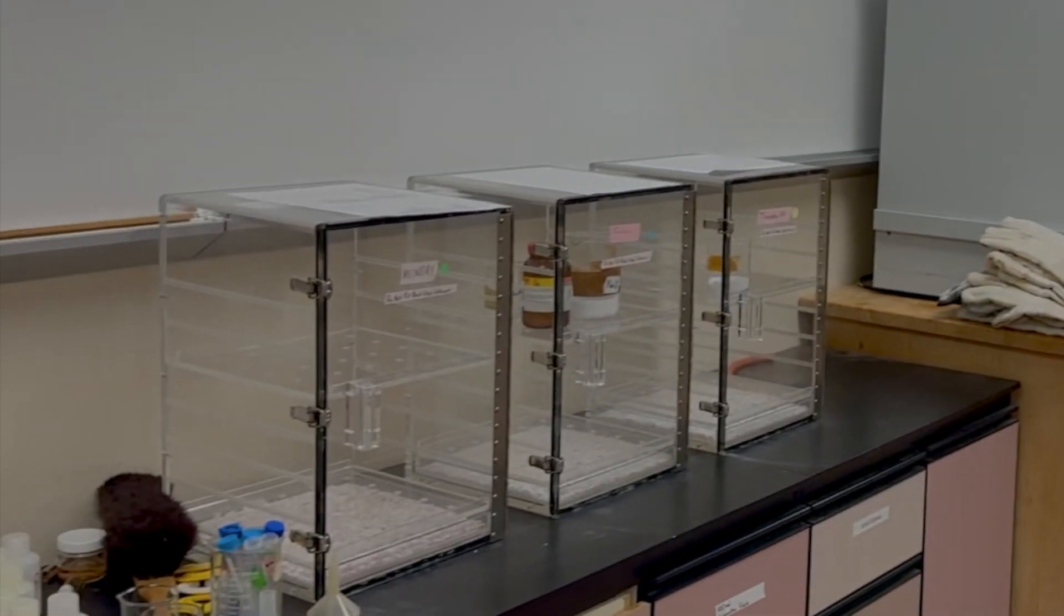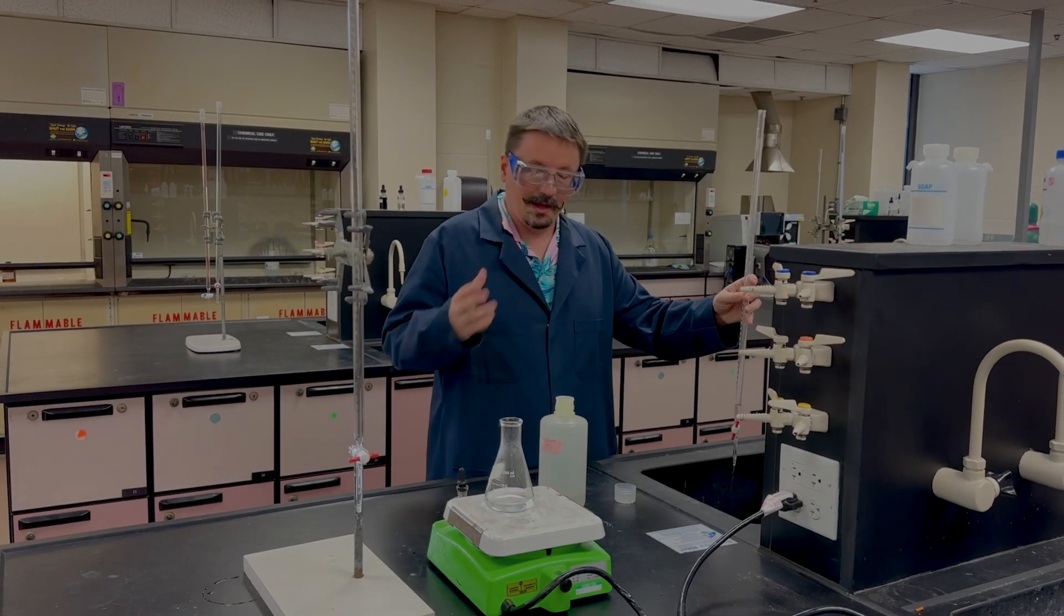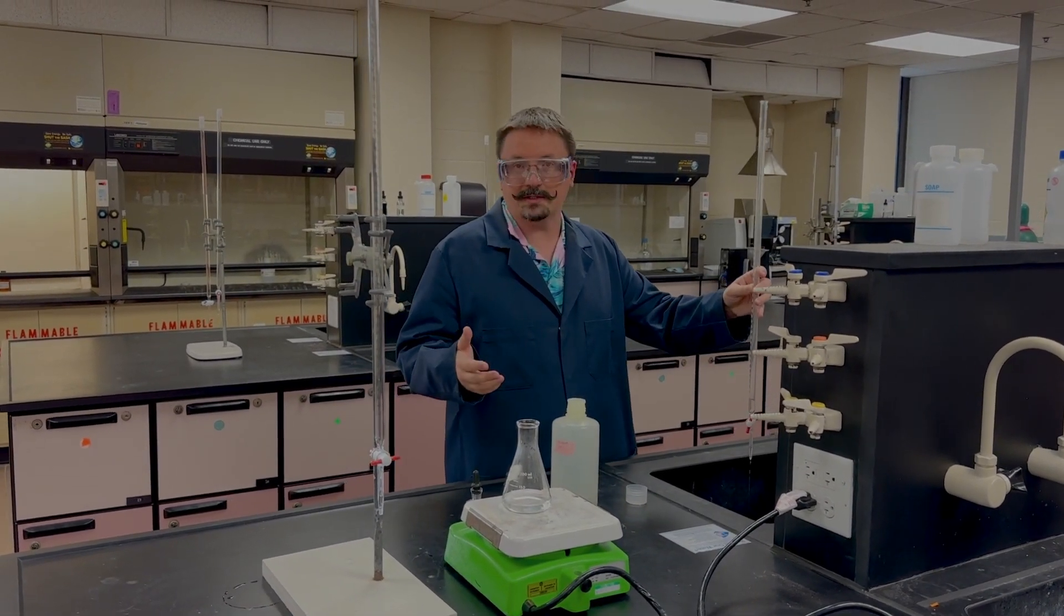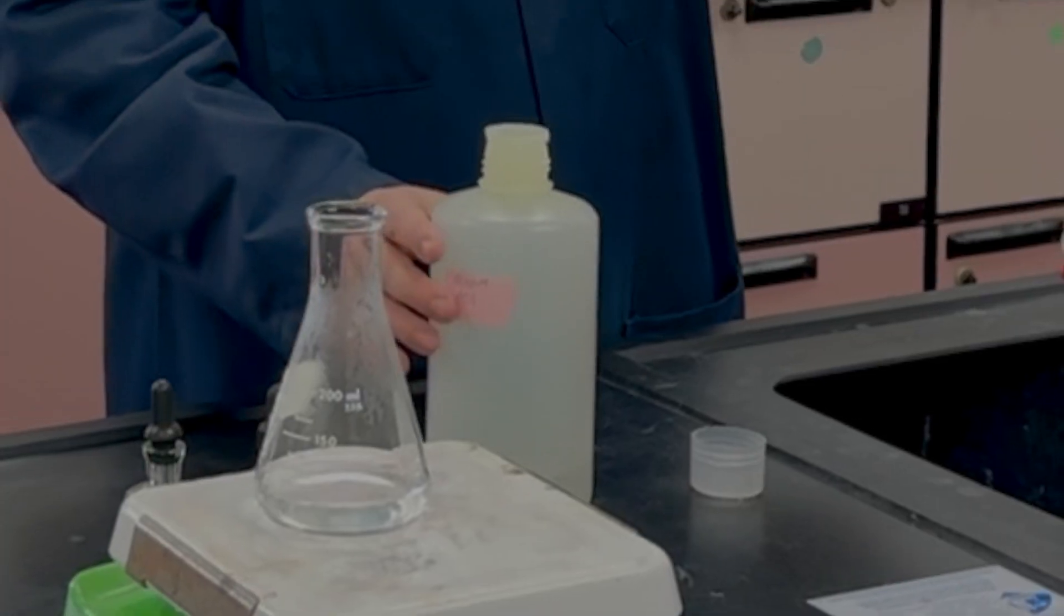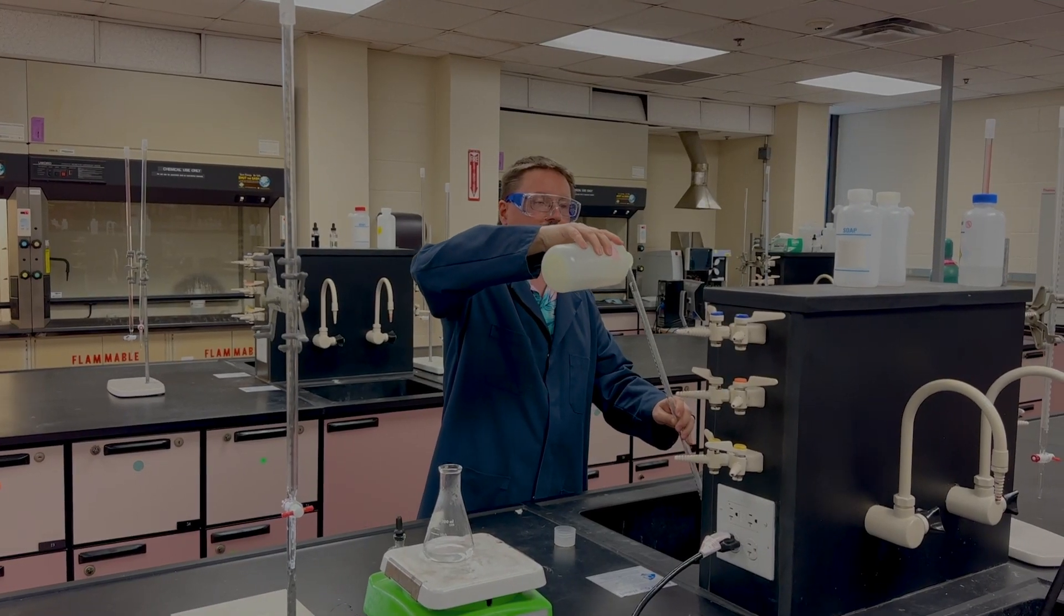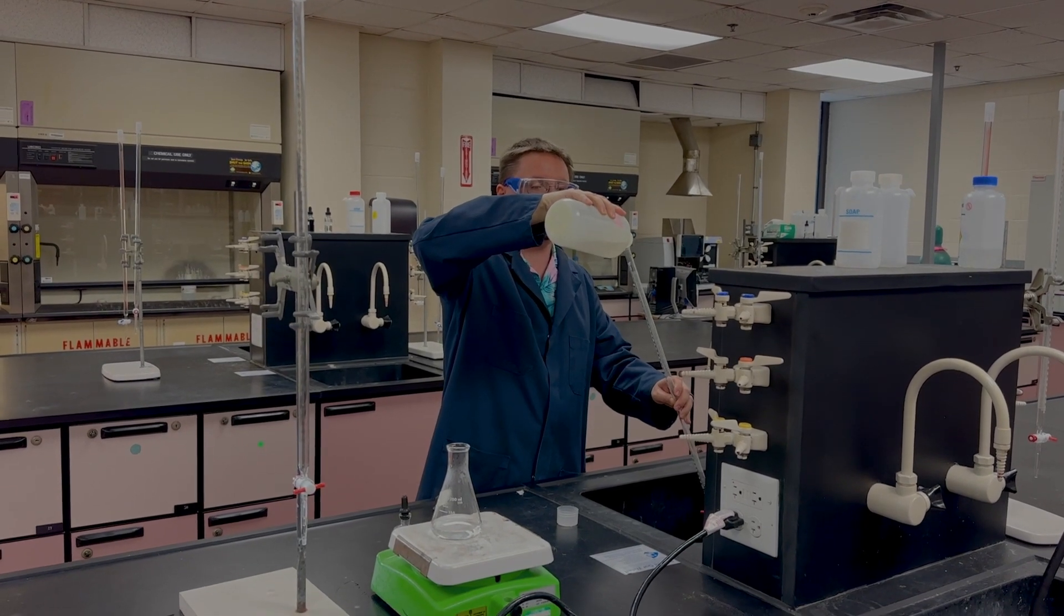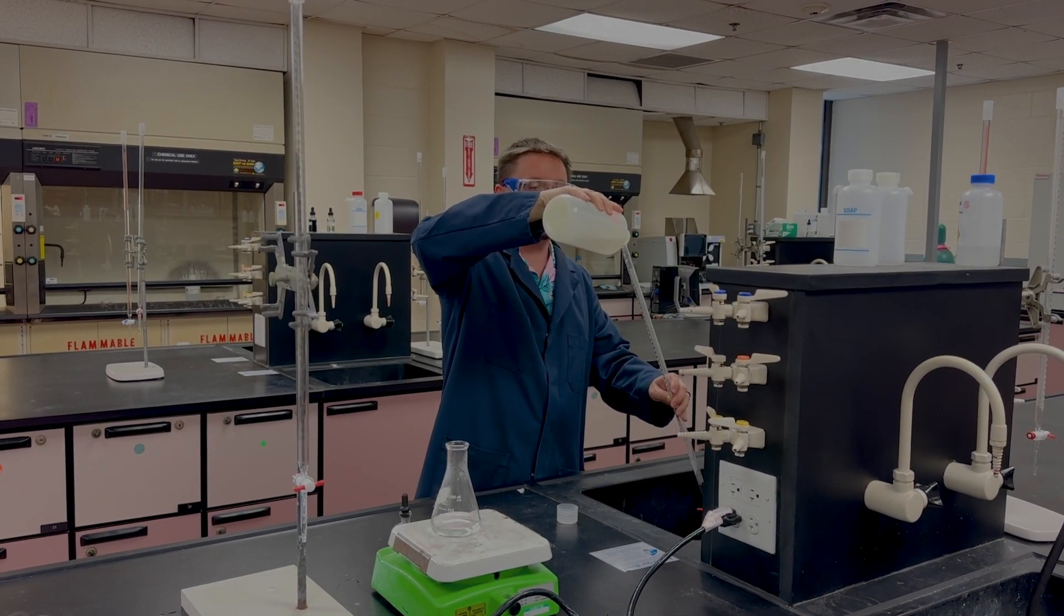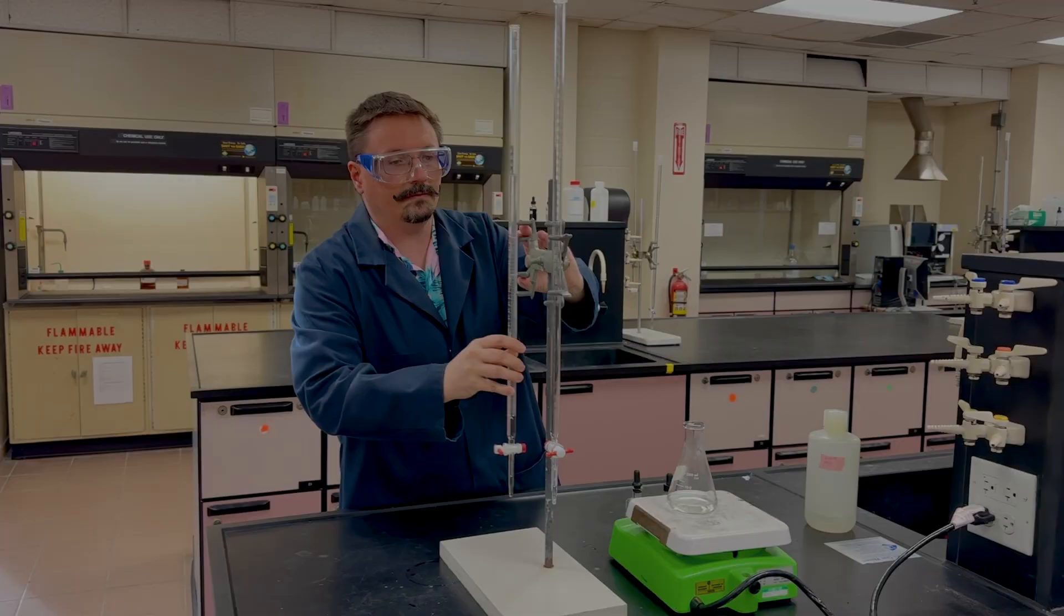Your soda ash unknown will be in the desiccator in a small sample jar, so make sure you get that out. Mass out 0.6 grams of that, go ahead and put that in your Erlenmeyer flask along with your 50 milliliters of water and swirl that. It should dissolve - might take a little while to get all of it to dissolve, but it should definitely dissolve.